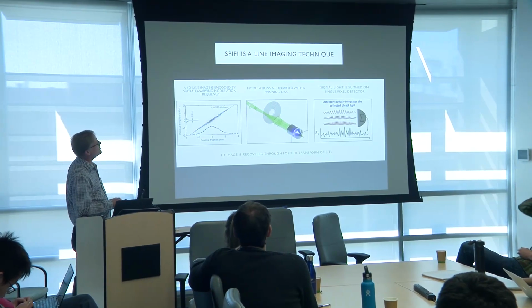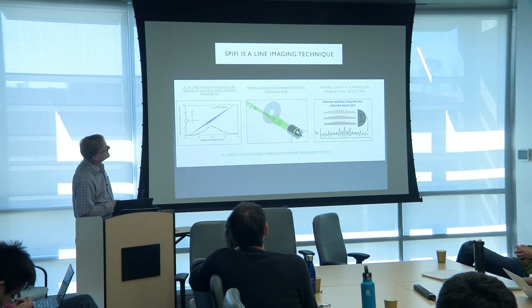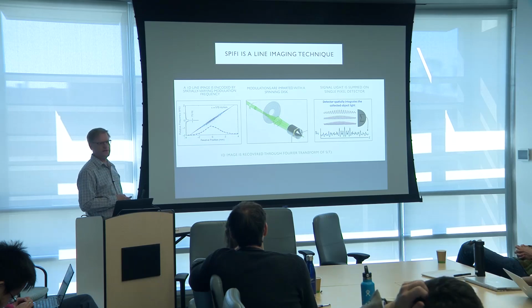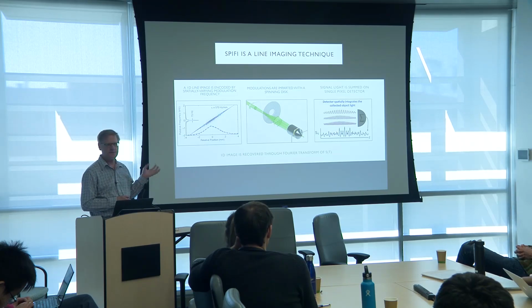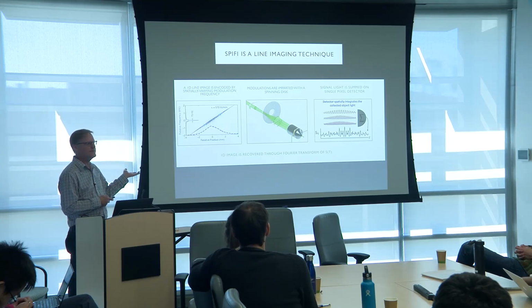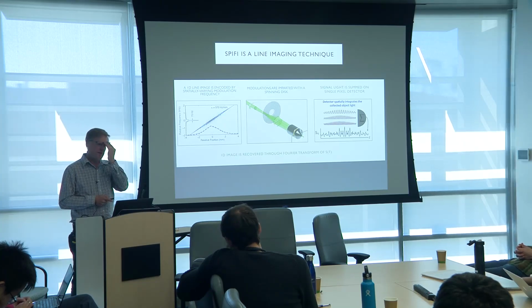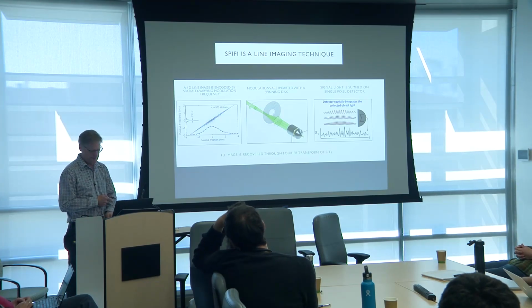So this is a more beautiful 3D rendering by Jeff Field at CSU of what this really looks like. There's our spiffy mask spinning. Here's our system. And then just to show you, if I picked 3 pixels along that line, they are blinking on and off at different rates. And my voltage versus time signal that I get out of my detector looks something like this. But if I Fourier transform that, I can get back the beam profile, and I'm not imaging anything. So now we've got extended source imaging with point detection. This is where I've got massively parallel beams in a sense.